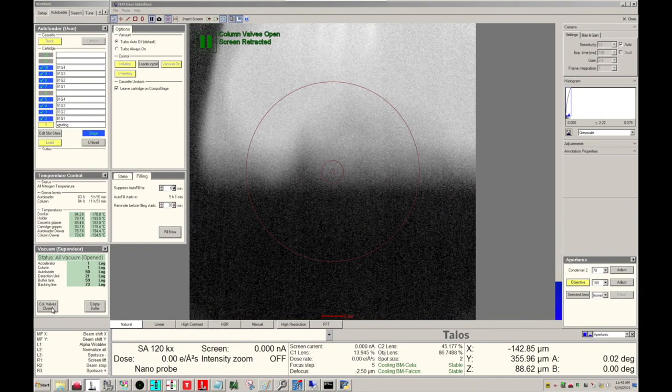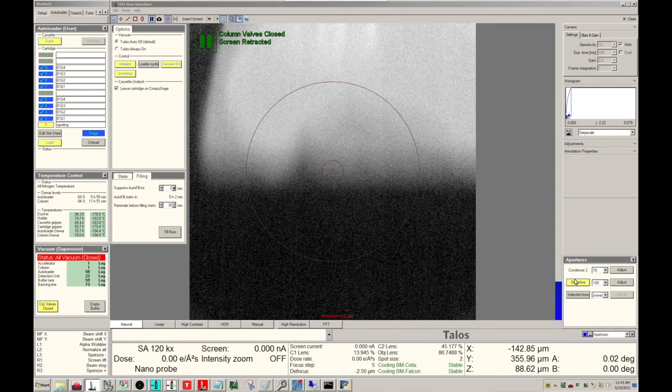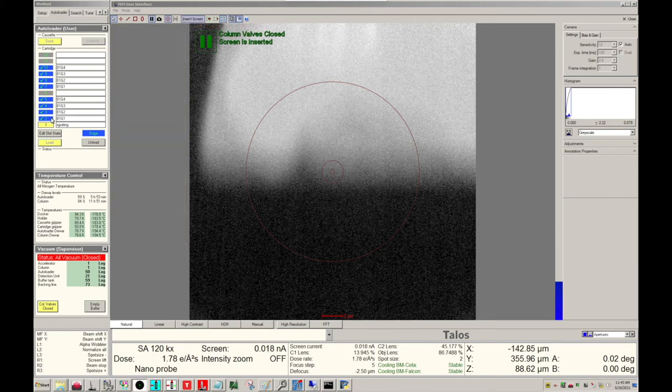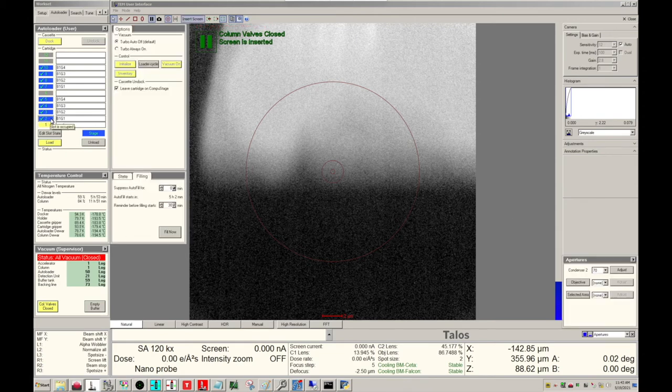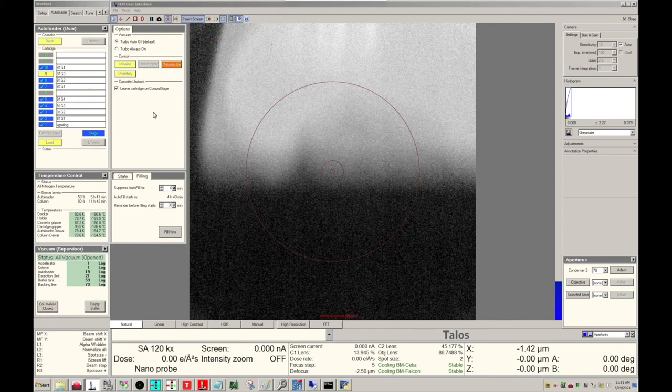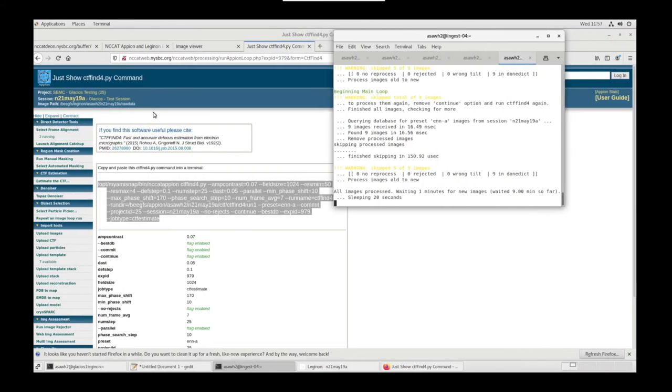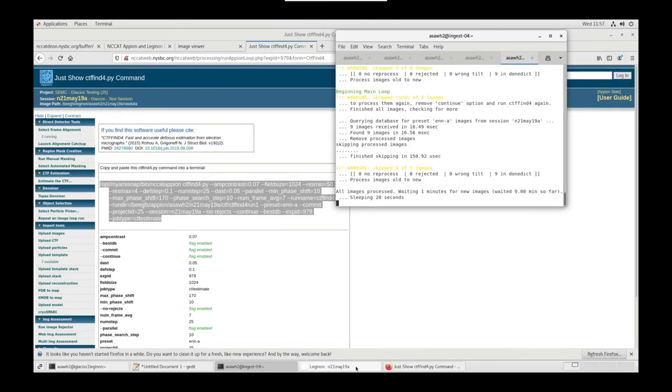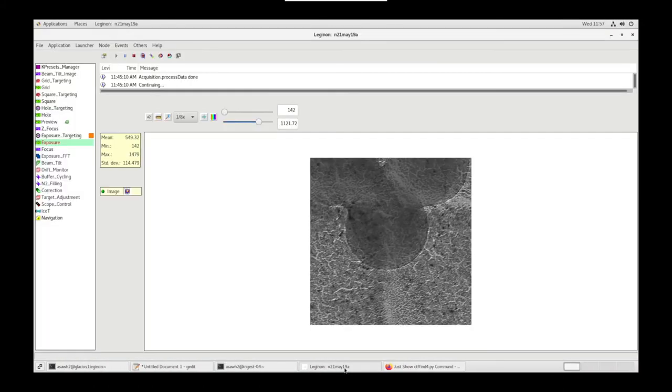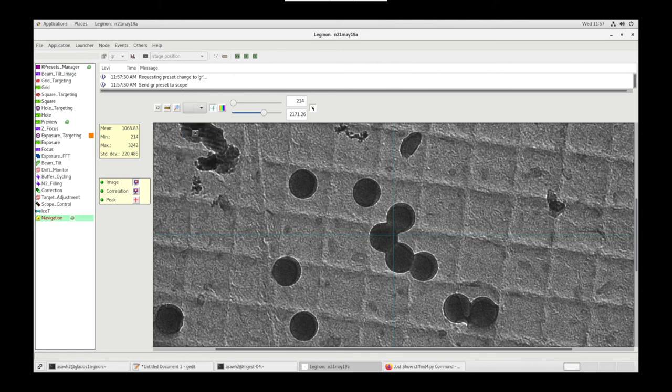On the Microscope PC, let's close Column Valves. Take out our Objective Aperture and load our first User's Grid. Open Column Valves. Let's go back into Legenon. Using Navigation, we can send Grid and Stage Position, Acquire.